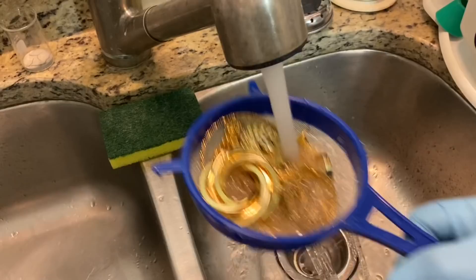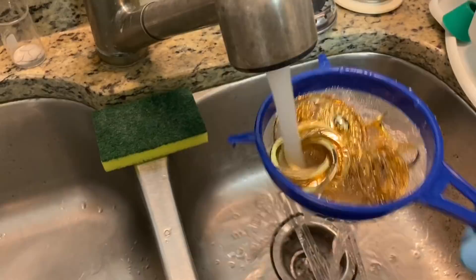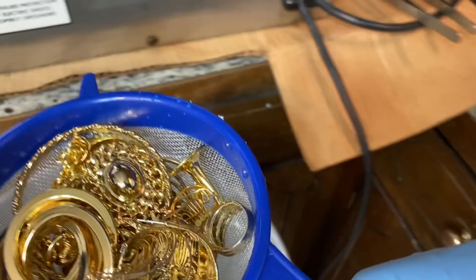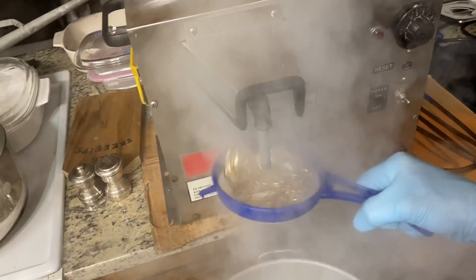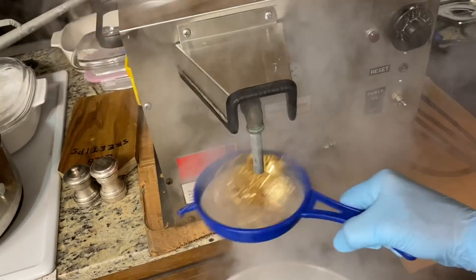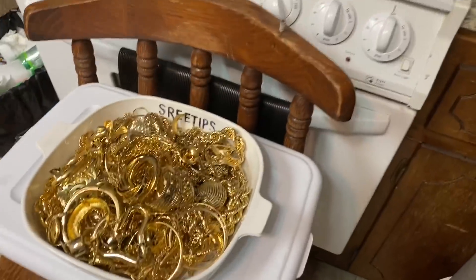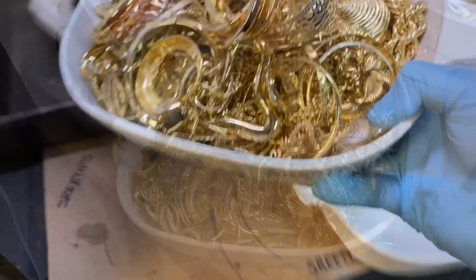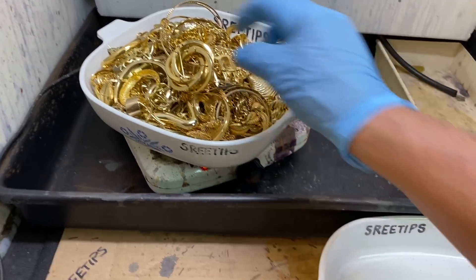If you don't do this, my thoughts are that there's going to be some scum that builds up in the cell. We're going to go out and set this up on some heat - low heat - and let it dry for about an hour.